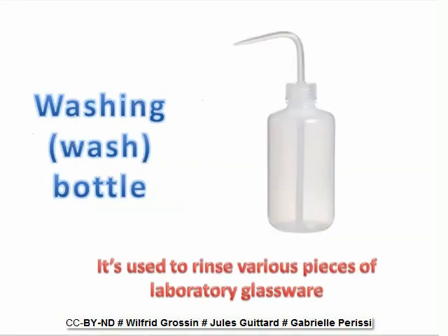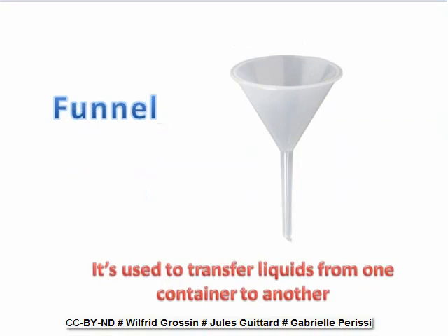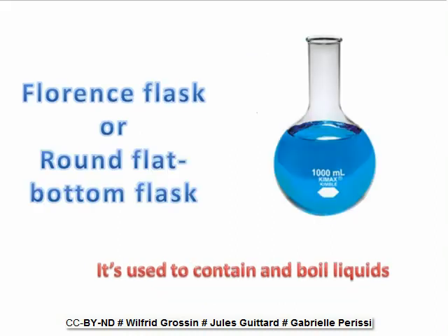Wash bottle. It's used to rinse various pieces of laboratory glassware. Funnel. It's used to transfer liquids from one container to another.